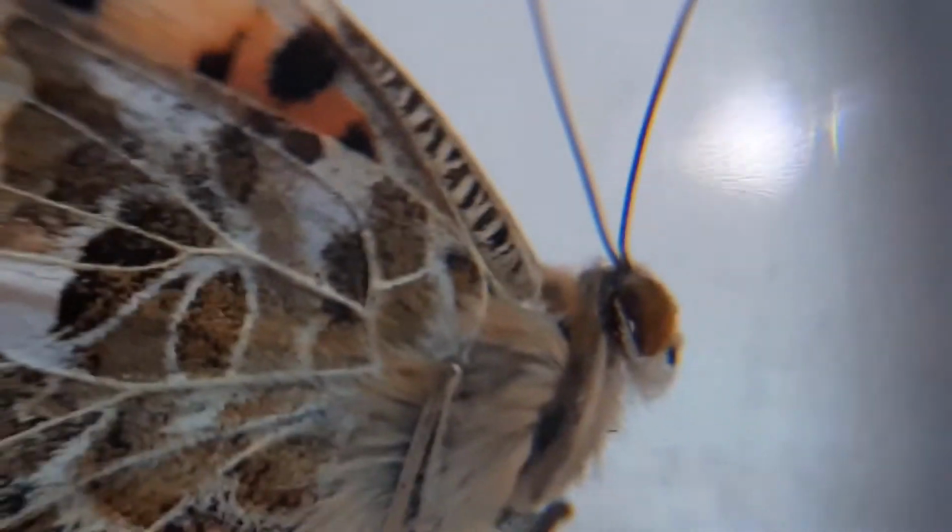Okay, the legs. We are going to make the slides for all of them and watch them under the Foldscope also. So this was the first 2.